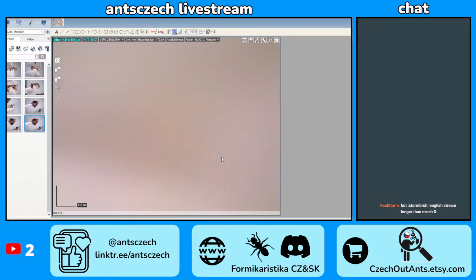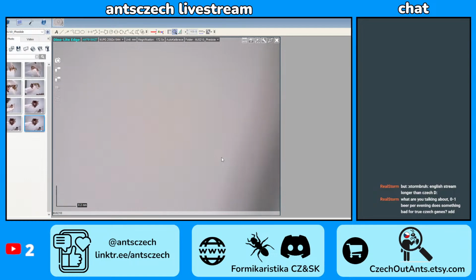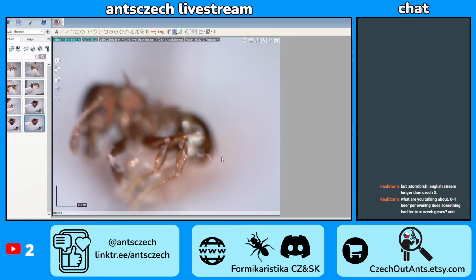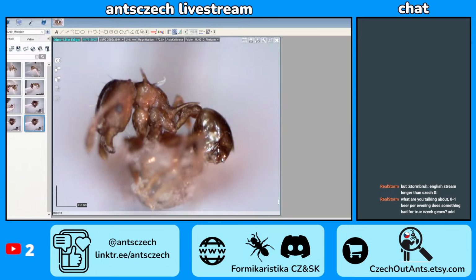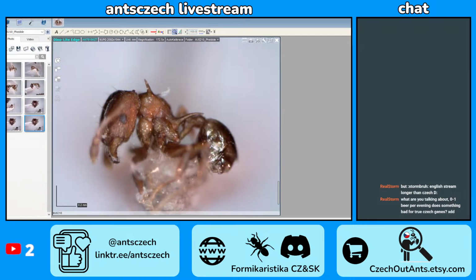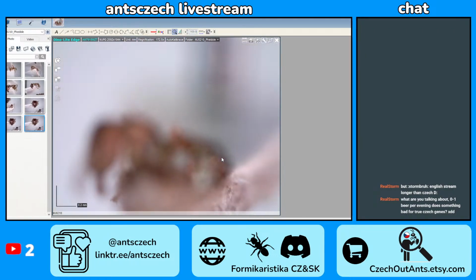The website is doing a heavy load. Oops. That is not good. Where's the ant? Oh, here it is. Ooh. Pronotal spines, propodeal spines. Pretty nice.